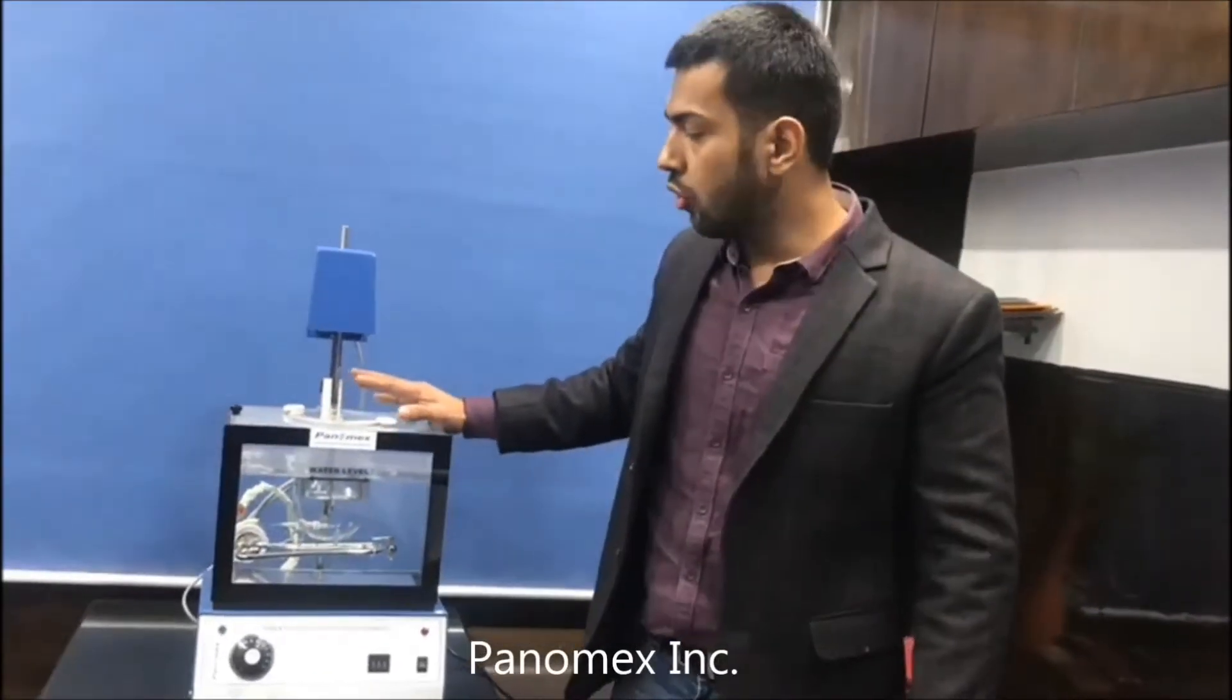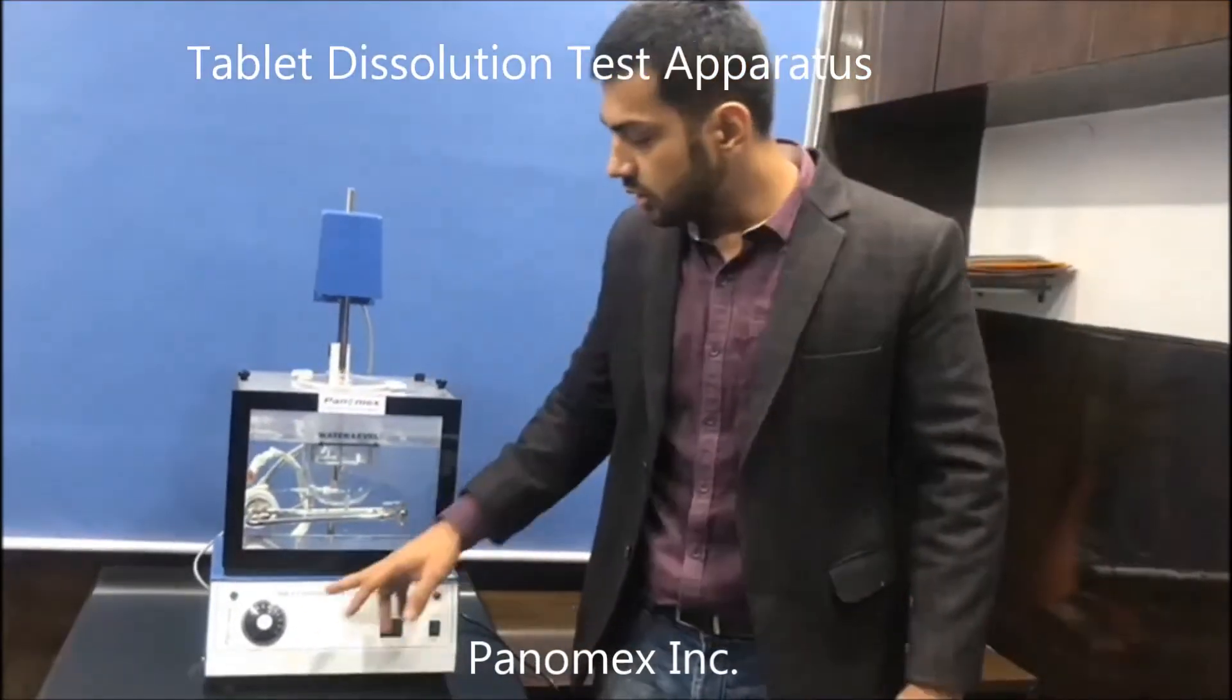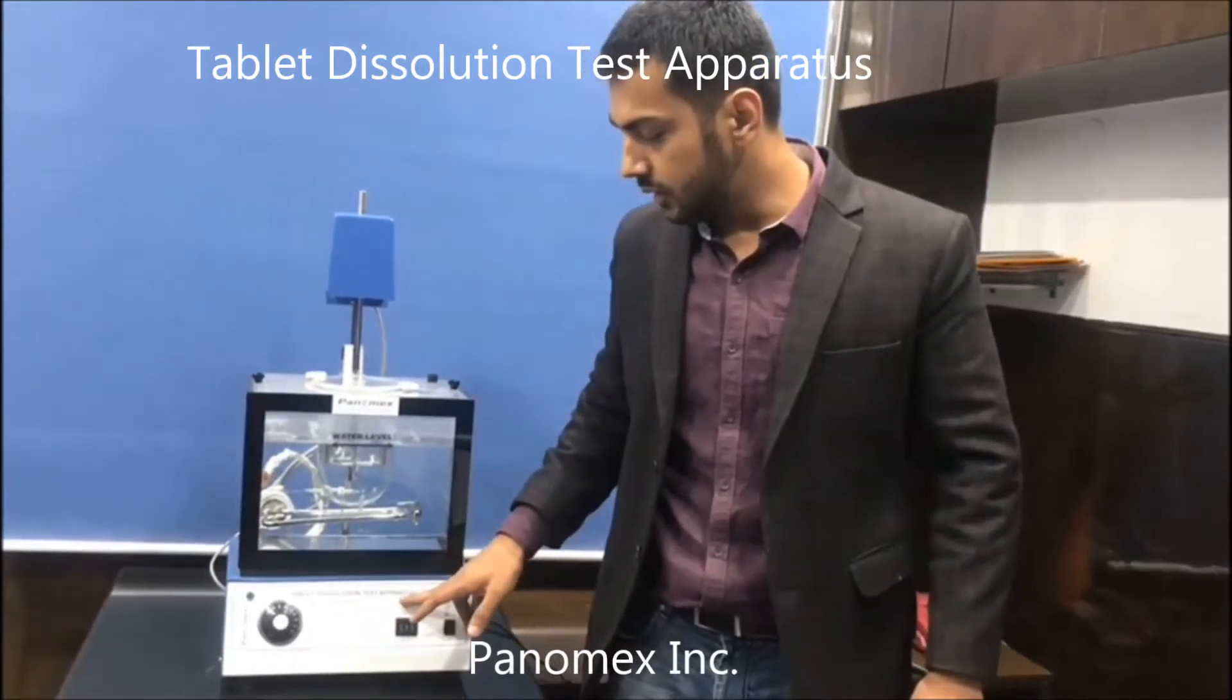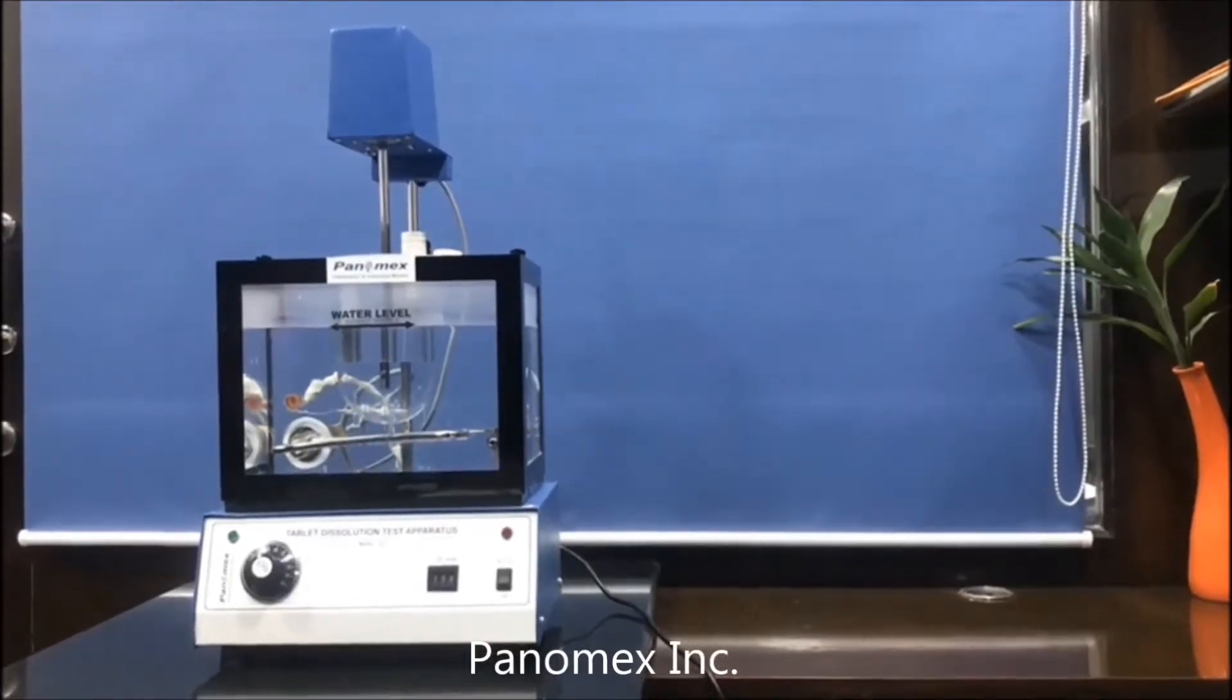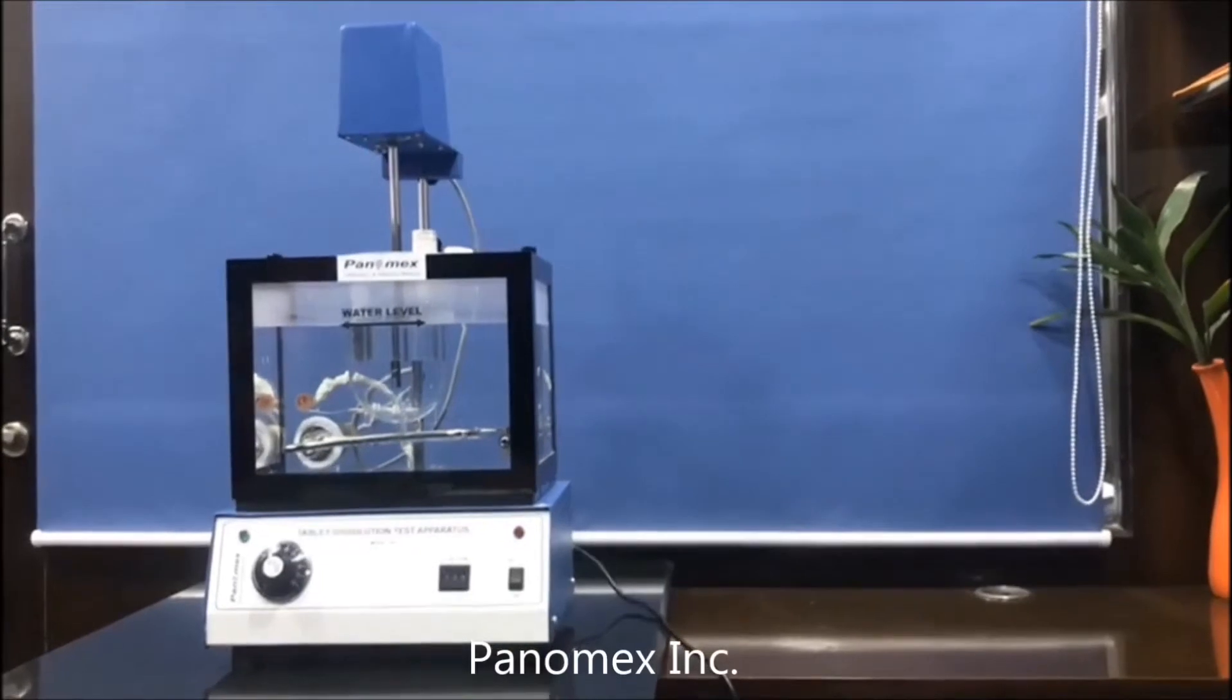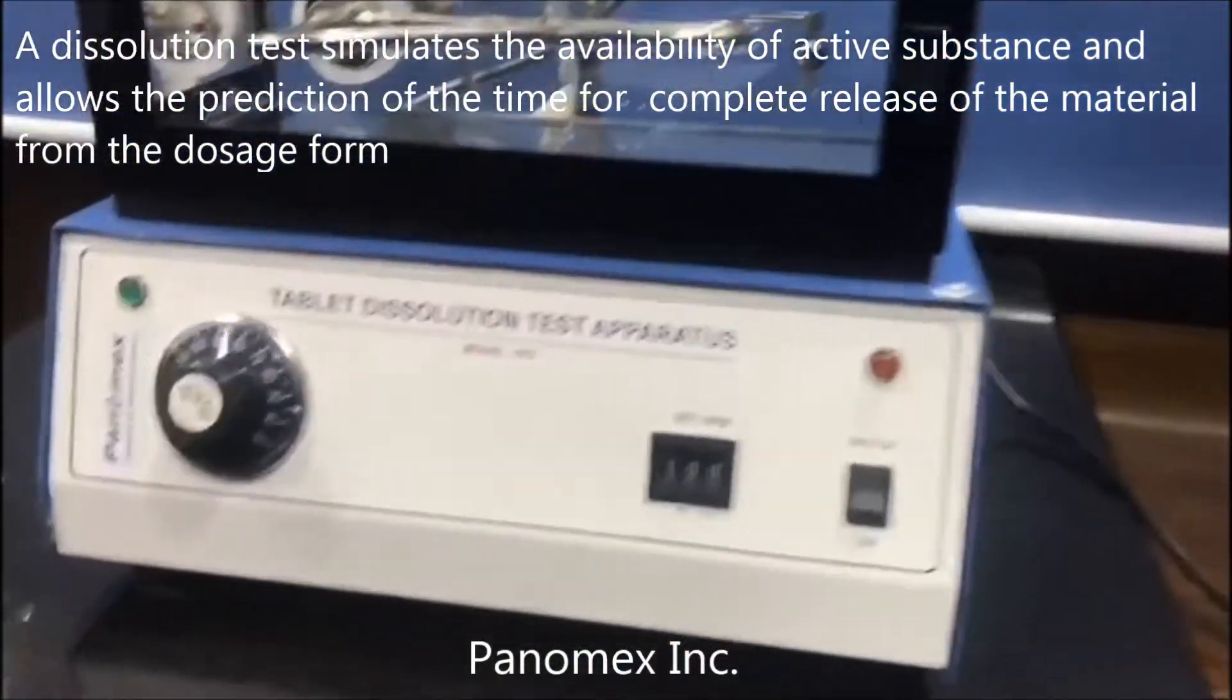Welcome to Panamax Incorporation. Today we are introducing our product, the tablet dissolution test apparatus. This apparatus is an instrument for the determination of percent dissolved of the active drug ingredient in any pharmaceutical formulation.